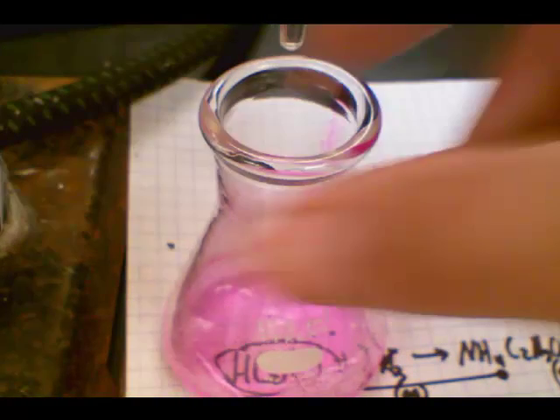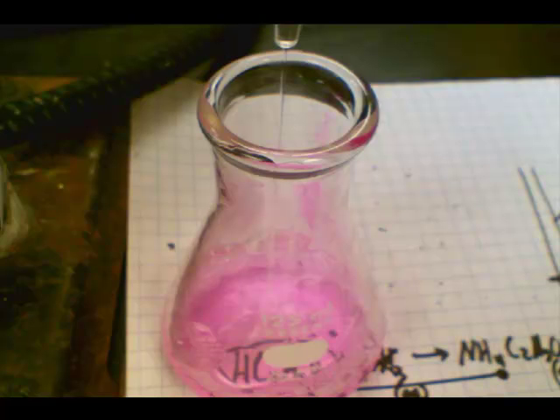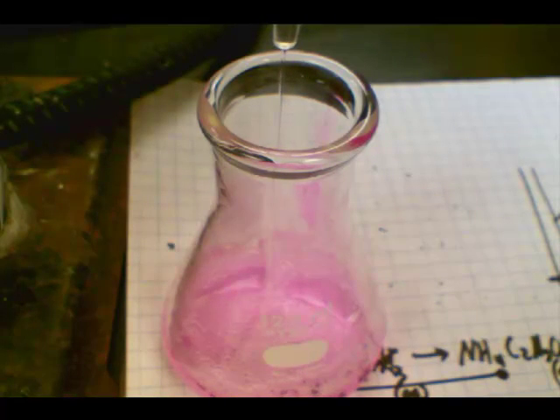Now, the closer and closer you get to your endpoint, the longer it's going to take to become certain what color it is. So you end up going very slowly, and this takes a long time. So I'm going to sort of clip a lot of this time out, and I'll talk to you next when we get close to the endpoint.